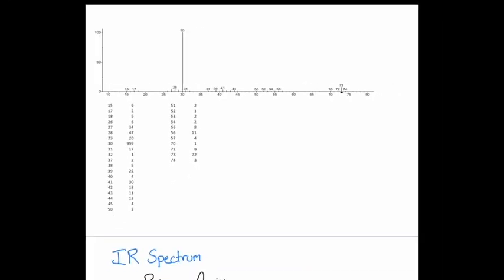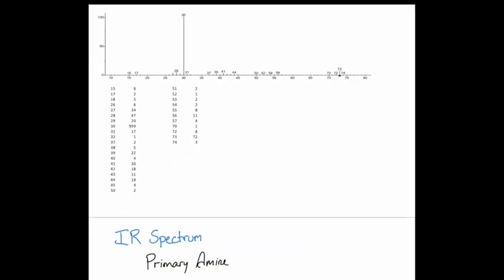So in this video, we're going to go through the analysis of our mass specs that I expect to see in your lab notebook for every mass spectrum that you get, right? You hand me a GC sample and I give you a mass spectrum of your compound, okay? In all of these mass spectra, they might look a little bit different depending on how I grab the data from the computer. I'll always indicate to you what your molecular ion peak is.